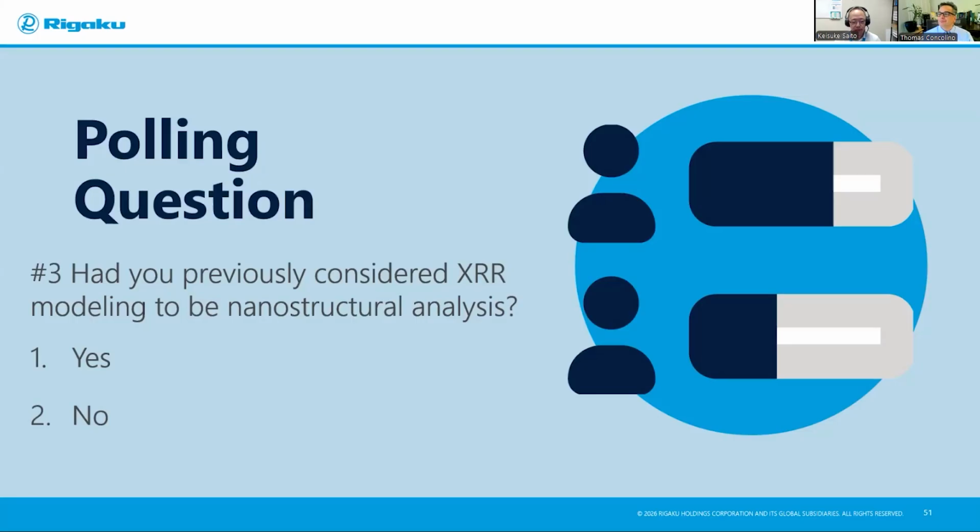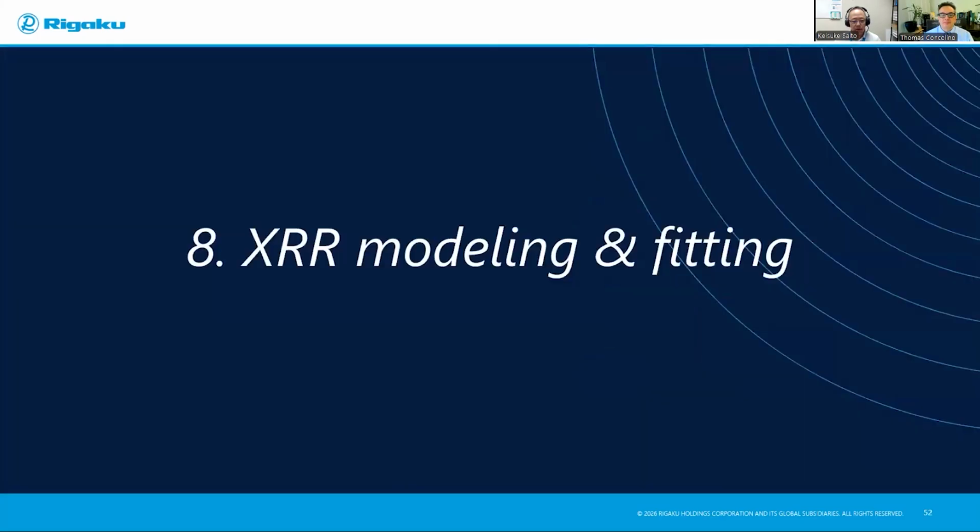Yep. Thank you, everybody, and Tom. All right, so let me discuss the last part of this episode, which is XRR modeling and fitting.